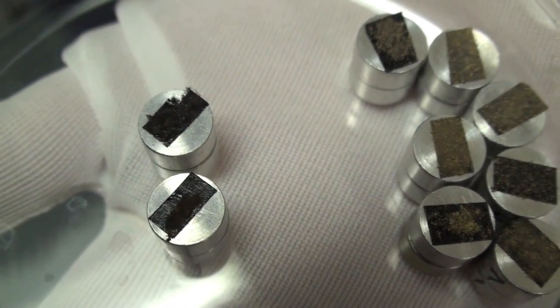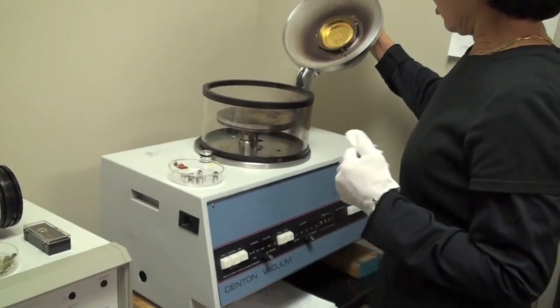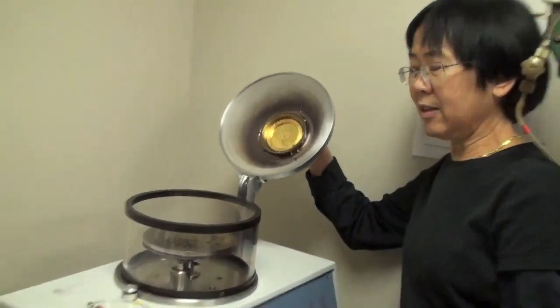So we're going to coat this one with gold so that we'll get good pictures of SEM. This is a gold sputter chamber, and gold. The gold target is here. You see that?